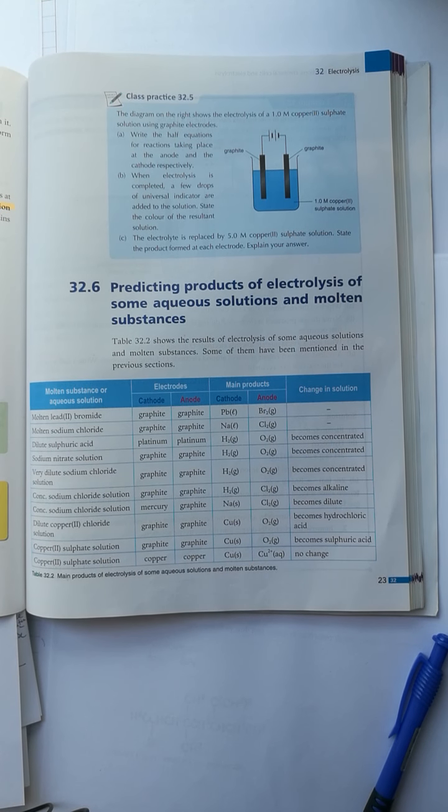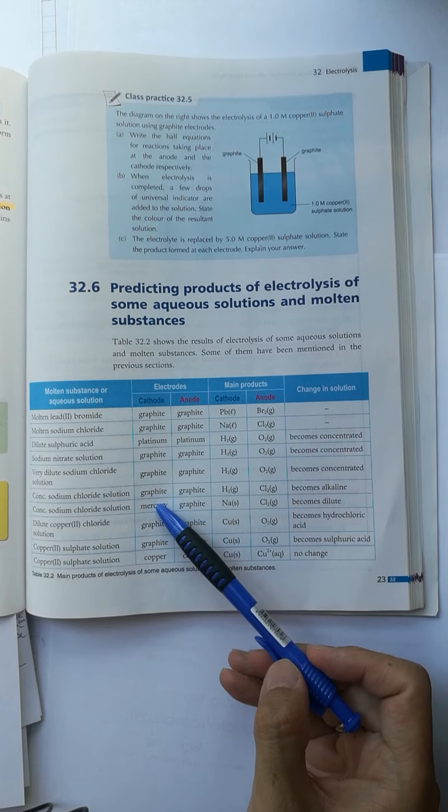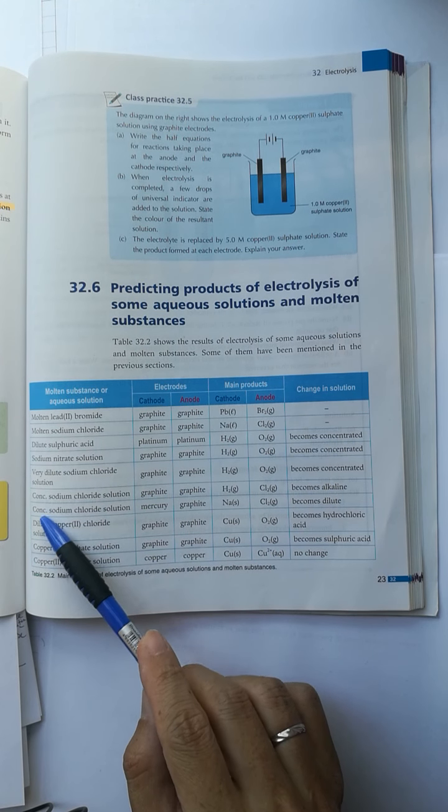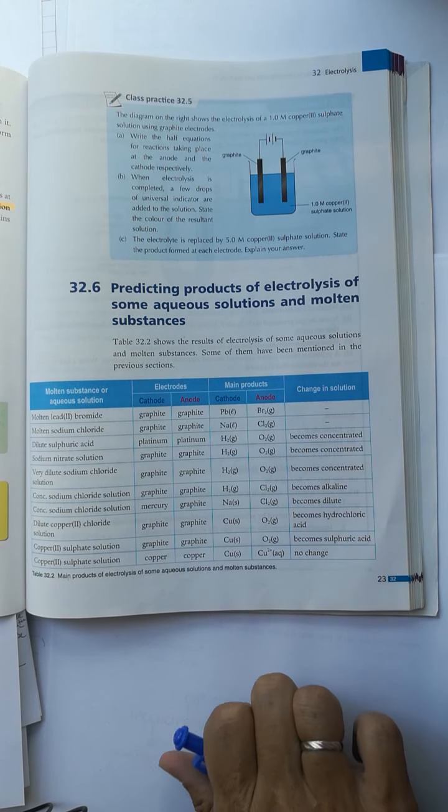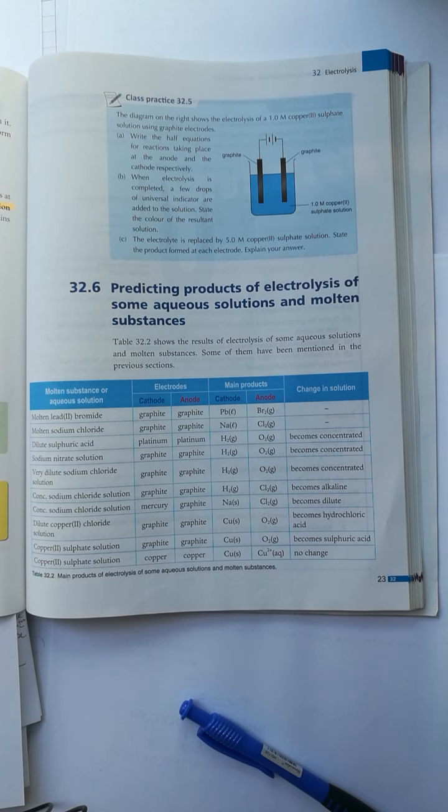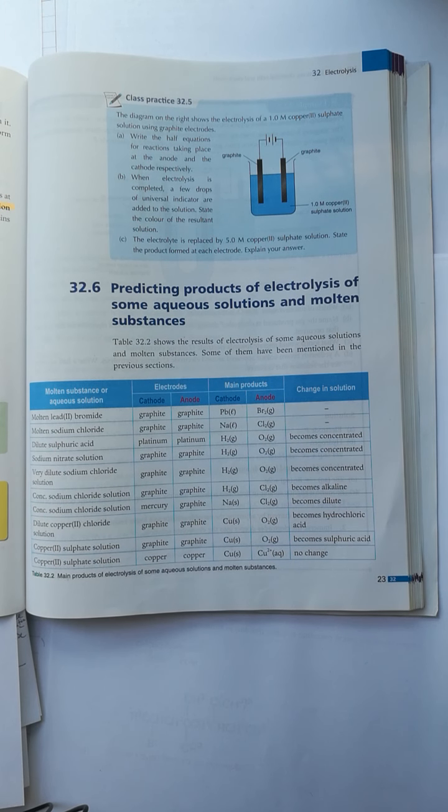After discussing the mercury electrode for concentrated sodium chloride solution electrolysis, we now consider copper(II) sulfate solution.